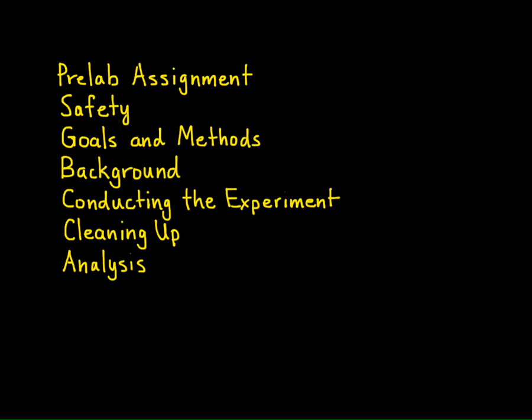In this presentation we will cover the typical material, including the pre-lab assignment, safety information, goals and methods of the experiment, background information about the aldol condensation reaction, how to properly conduct the experiment, how to clean up, and lastly, some key points about the post-lab analysis questions.